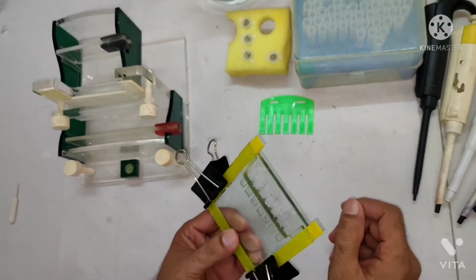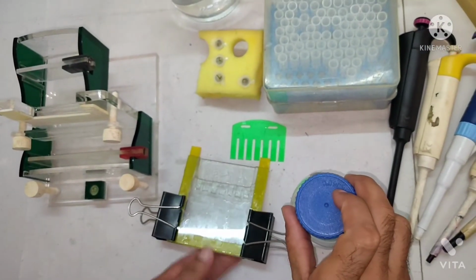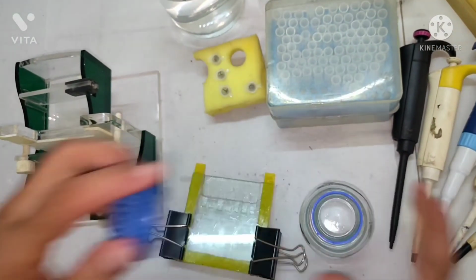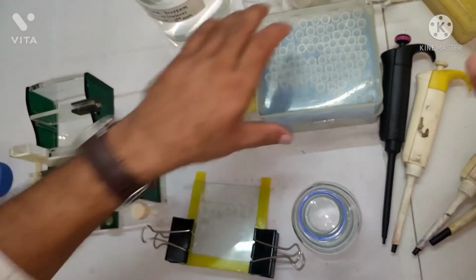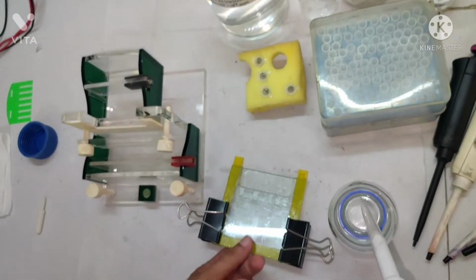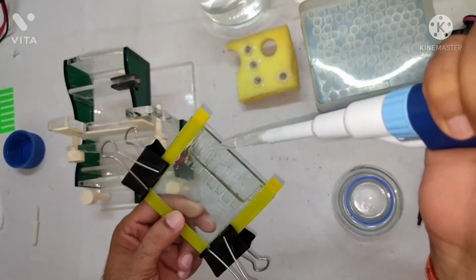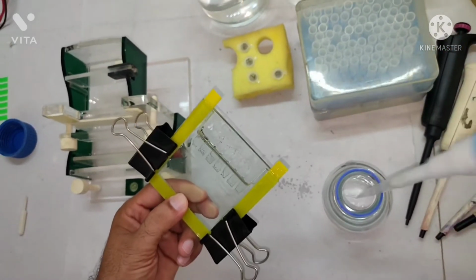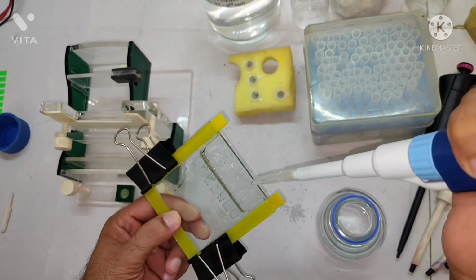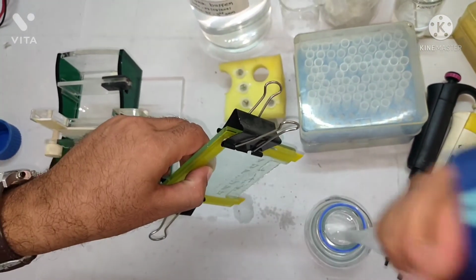Now you clean the wells first with distilled water. Your wells should be very clear, otherwise during the loading of your sample you will face many more problems. So by having the distilled water, I am washing the wells. You can put it here, no problem.